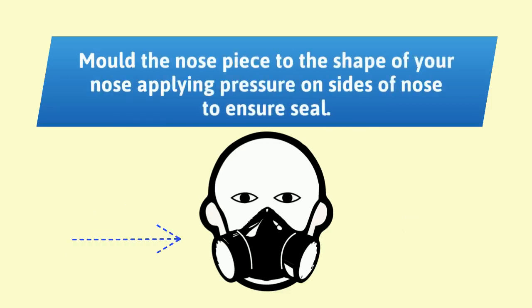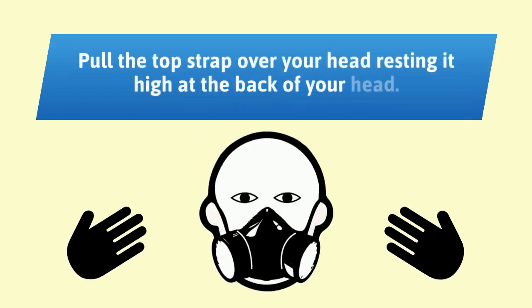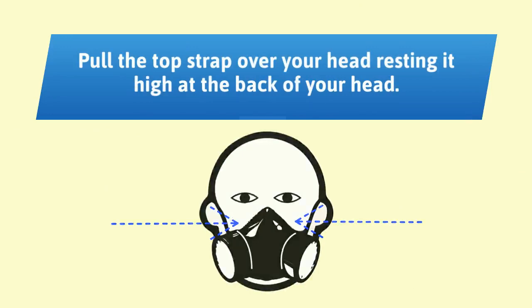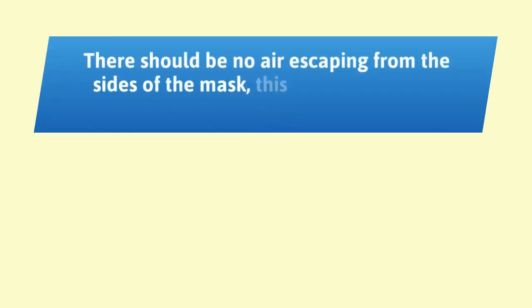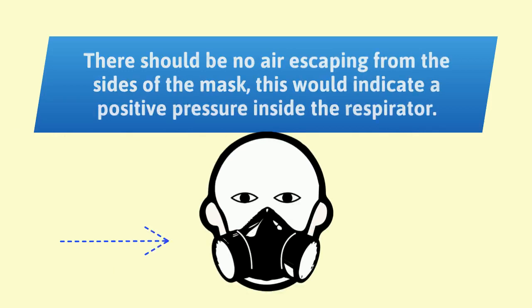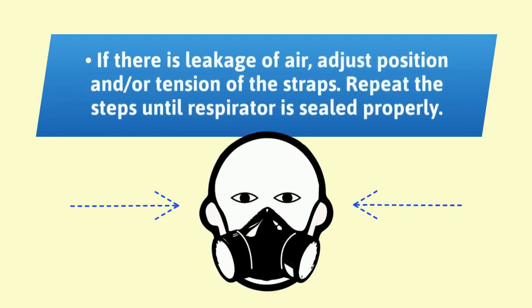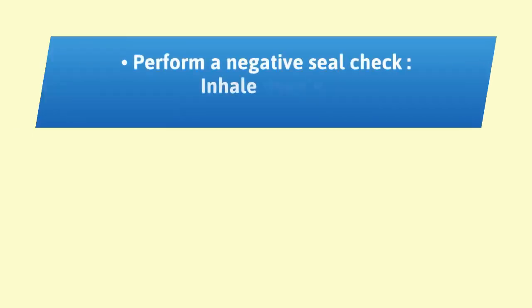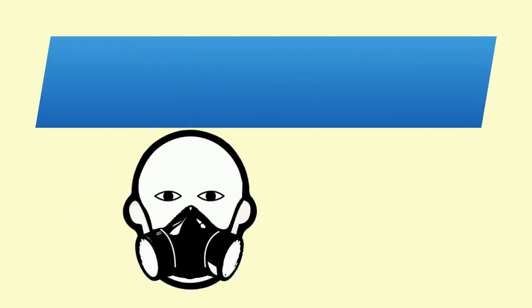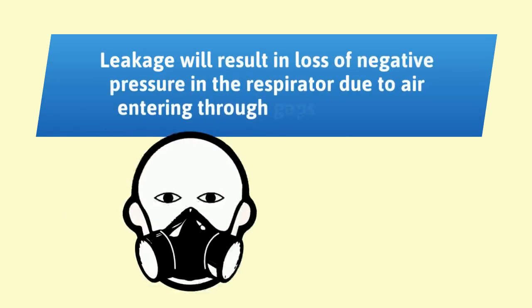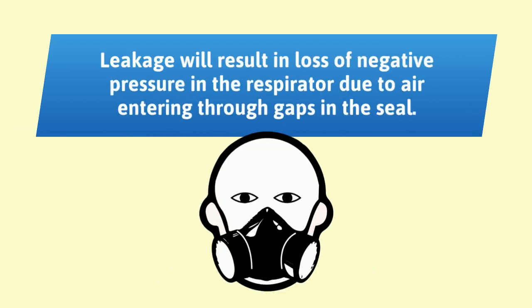Place the fingertips of both hands at the top of the metal nose piece; mold the nose piece using two fingers on each hand to the shape of your nose, applying pressure on the sides to ensure a seal. For a positive seal check, press your hands at the top and side of your face without touching the mask, then exhale sharply — there should be no air escaping from the sides, indicating positive pressure inside the respirator. If there is air leakage, adjust position and tension of the straps and repeat until the respirator is sealed. For a negative seal check, inhale deeply — negative pressure should make the respirator cling to your face. Leakage will result in loss of negative pressure due to air entering through gaps in the seal.